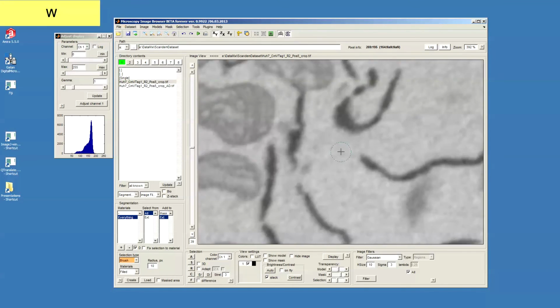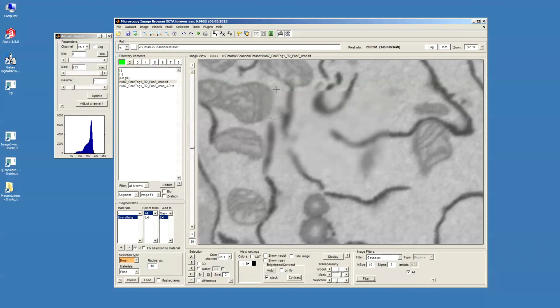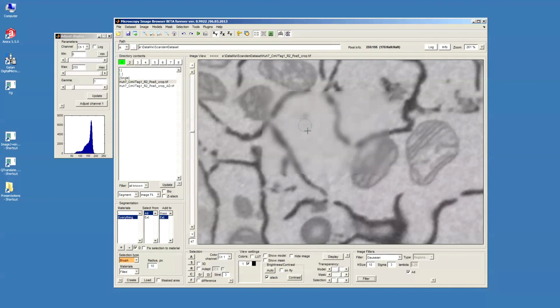So for example, if I zoom in to a certain part of the dataset and I would like to filter this area, filter only the part which was within the viewing axis. It allows performing some of the actions in 3D, for example, for some fast checks of certain filters, because I can always undo the result by pressing Ctrl Z.